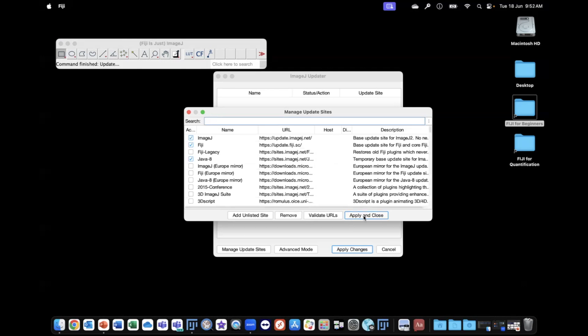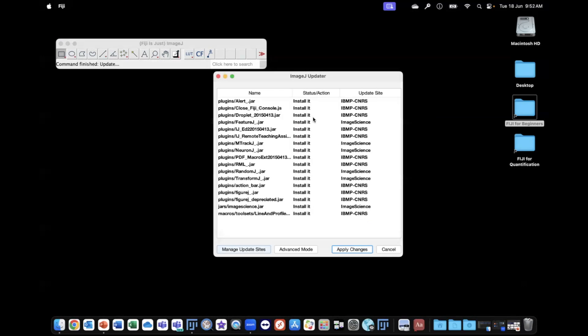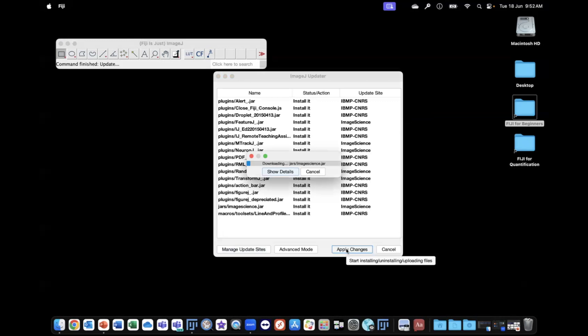I'm going to hit Apply and Close, and this will come up with the different parts that are required to be updated. We hit Apply Changes.